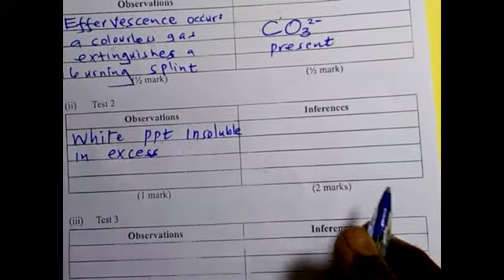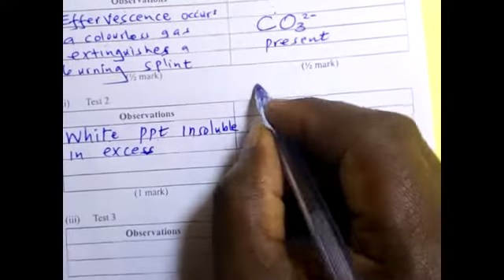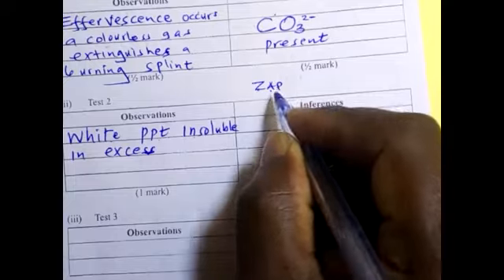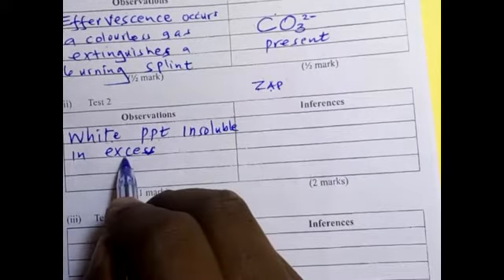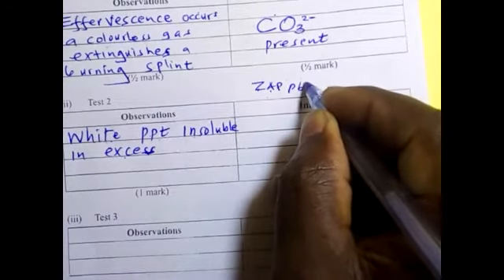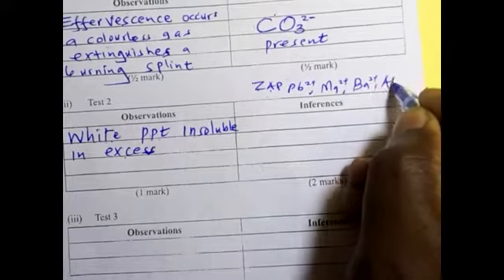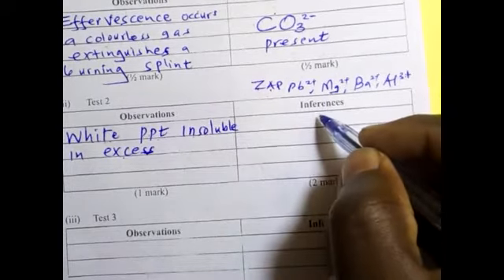Now here we would want to challenge, because if it was insoluble in excess, from the amphoteric ions we know we have the ZAP, the zinc ions, the aluminium, and the lead ions. Because a white precipitate was formed which is insoluble, could it be so many? Could it be lead? Yes. Could it be magnesium? Could it be barium, aluminium, and the rest? But we are going to cancel some out.